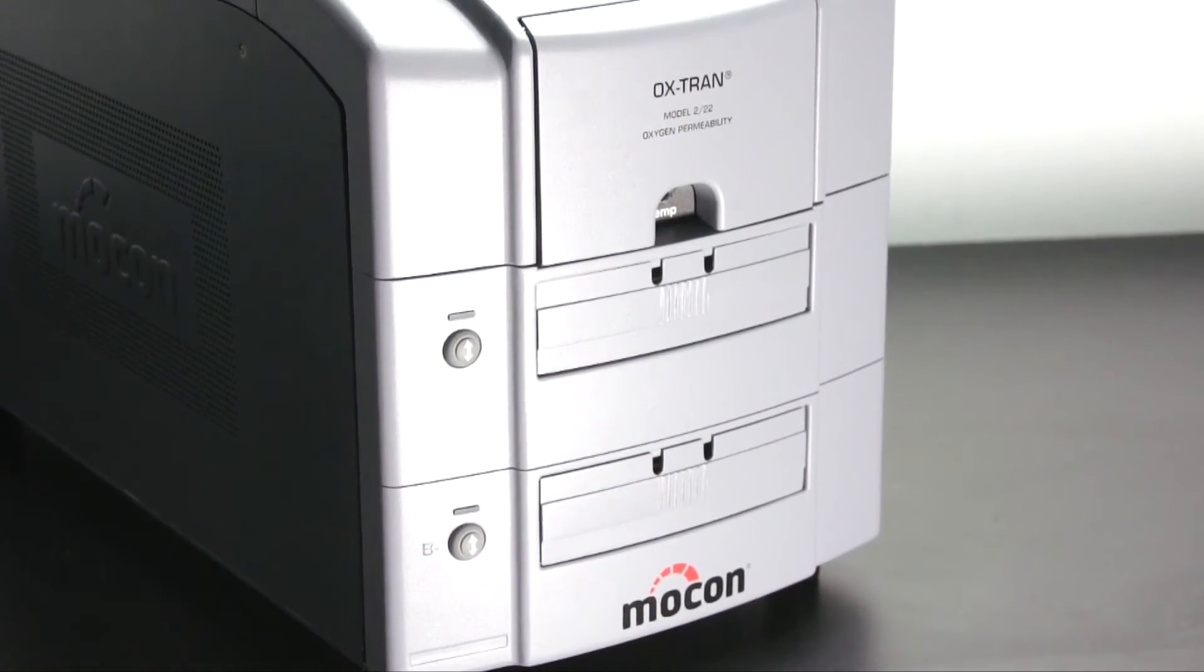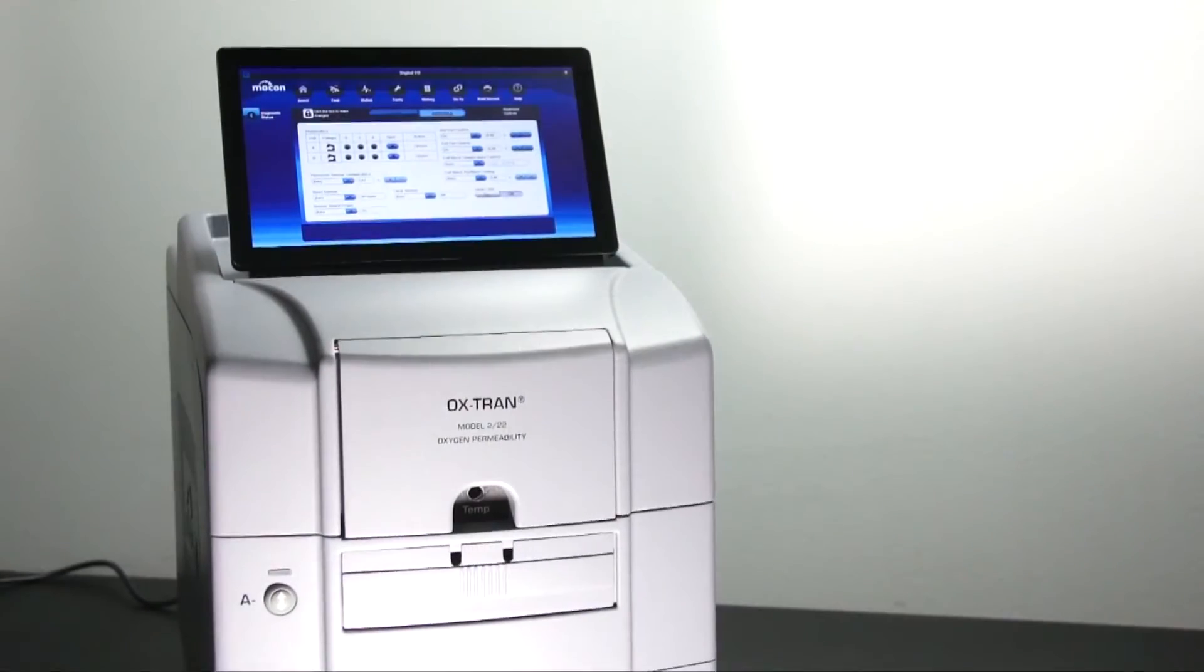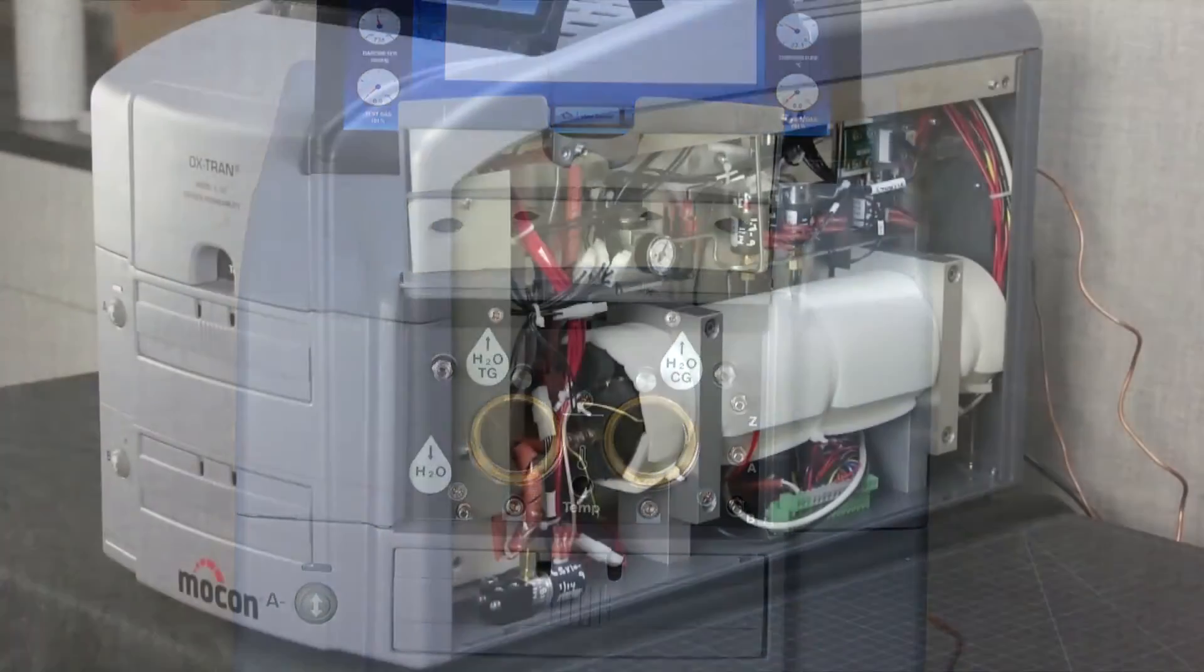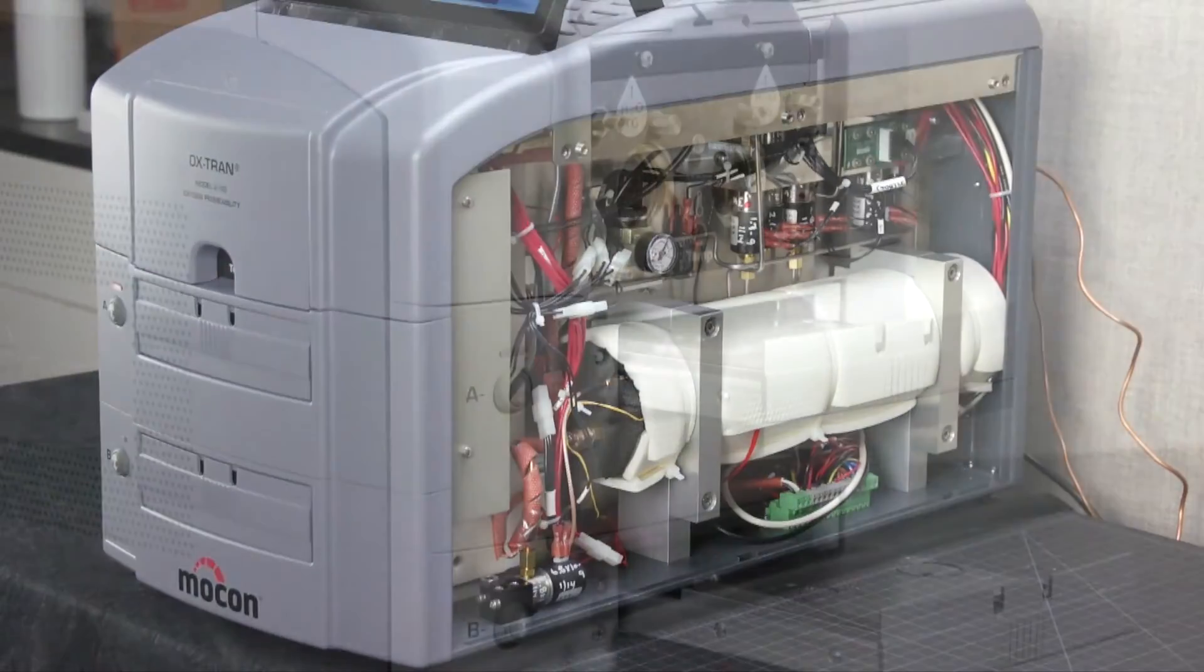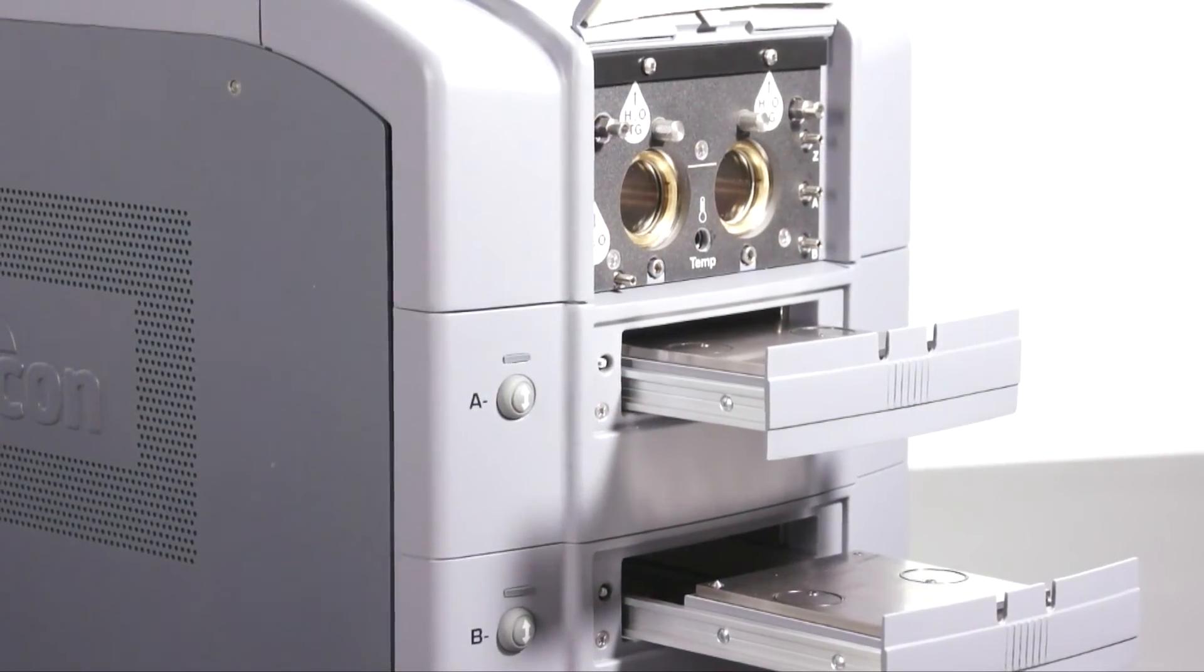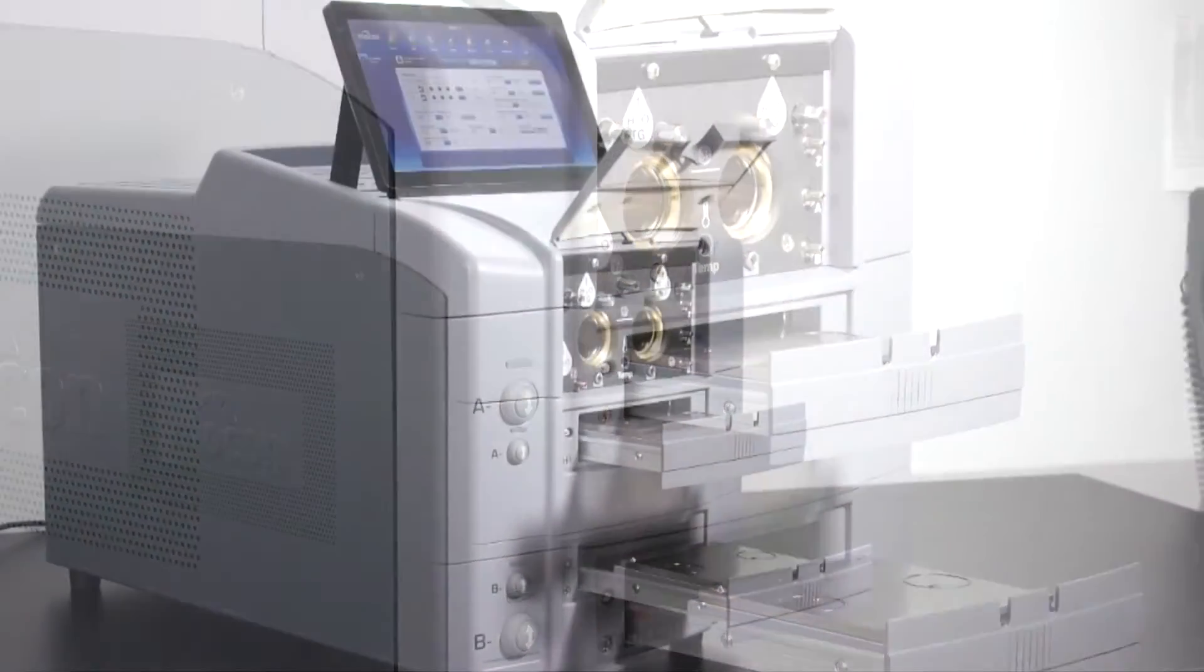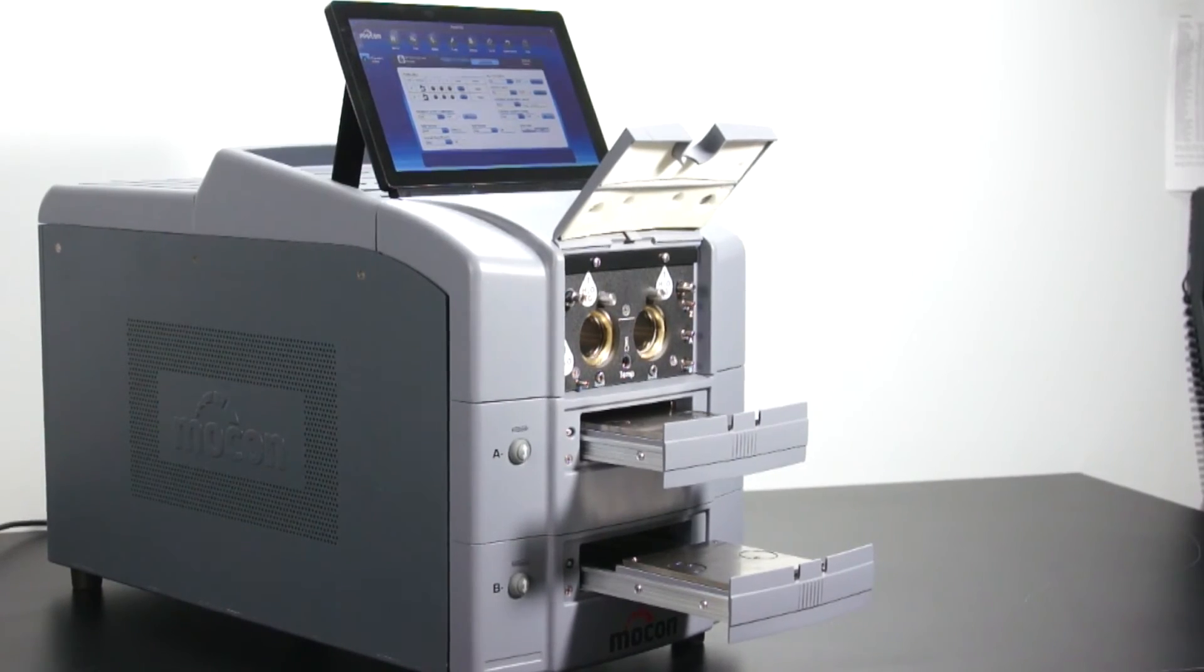Fully automated means that in addition to automatic test mode, the instrument will automatically control and maintain the set relative humidity of both the test and carrier gases. It will also control line pressure, gas flow, and temperature while saving, exporting, and printing test results.